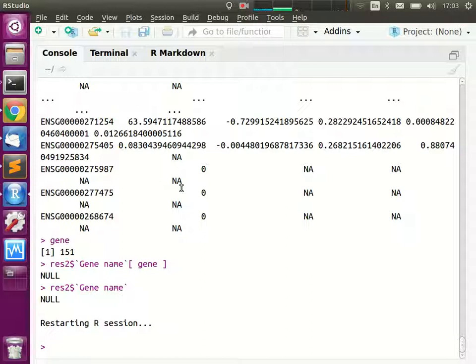And we downloaded all the FastQ files, we aligned them using the separate alignment. Then we used the featureCounts tool in order to count for each gene how many reads map to it, and then we quickly ran it through DESeq.